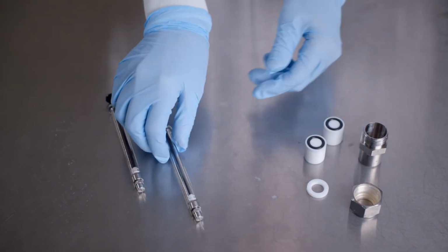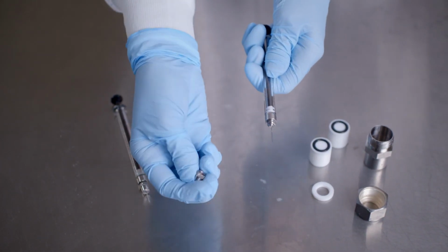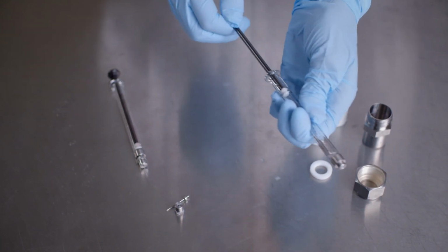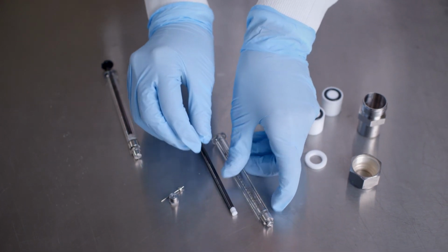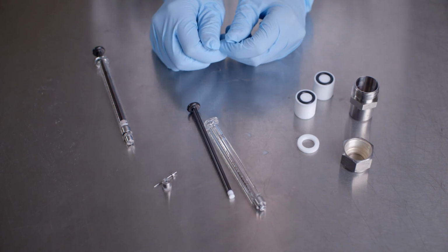For our syringes, completely disassemble both syringes after use. Depending on your application, clean your syringes with DI water, isopropyl alcohol, or a mild detergent solution. No matter what you choose for cleaning, be sure to rinse with copious amounts of DI water and allow the syringes to dry completely prior to reuse.